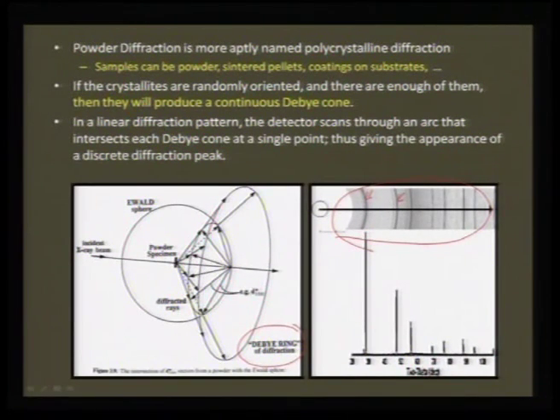And if you see here, the intensity also tells which reflection is going to be at its maximum. For example, this is a darker shade compared to these peaks, therefore, we can say that these peaks are highly intense compared to the other ones. So, this peak for example is intense, but this peak is less intense, so it comes out like this.